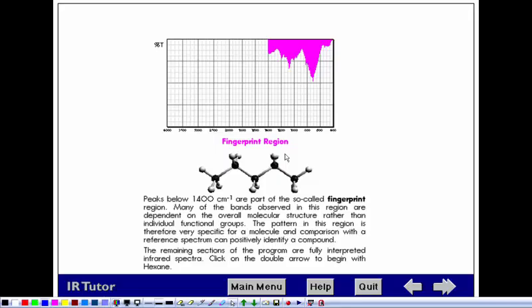Although I don't think anthrax would actually have a unique infrared spectrum, but I think somebody mailed a whole bunch of envelopes containing a mysterious white powder to the New York Times or somebody yesterday, and so I'm sure infrareds have been used to try and figure out what that powder is. But you can use that to compare to unknowns.